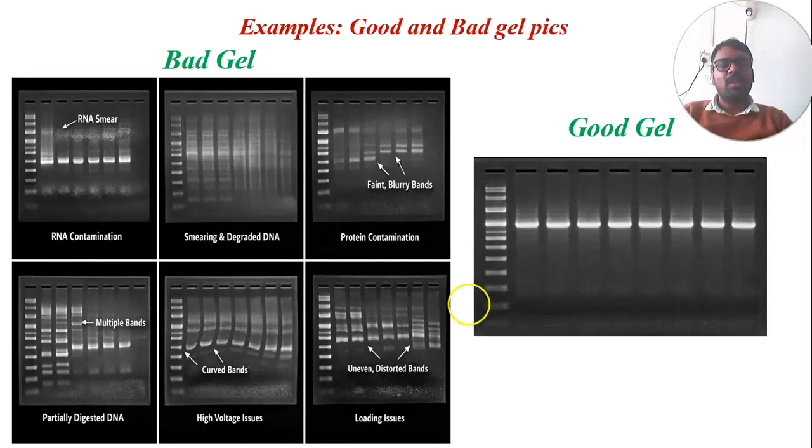If the bands are not that bright, that means you can go for a very small amount of dilution for that particular DNA sample. So that's how we are going to do it by the visual method, that is, based on the gel.